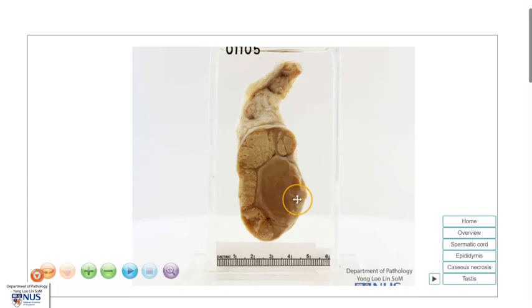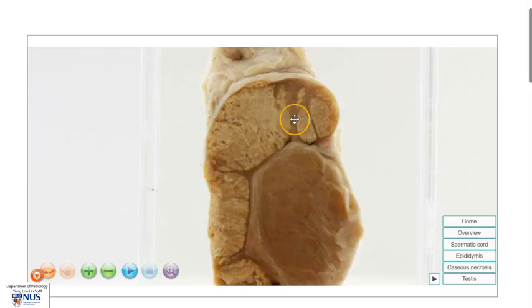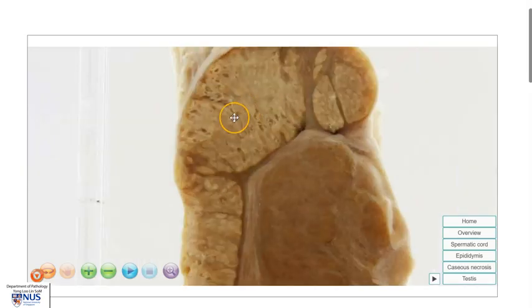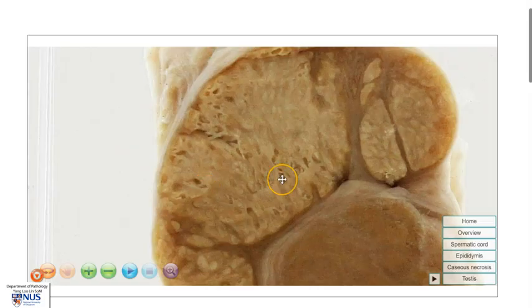In summary, this is an example of tuberculosis epididymitis where the epididymis is nodular and enlarged and appears to be largely replaced by caseous necrosis, where we can see this pale yellowish, cheesy appearance grossly. Thank you.